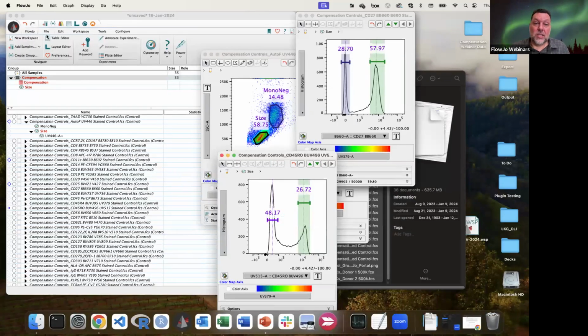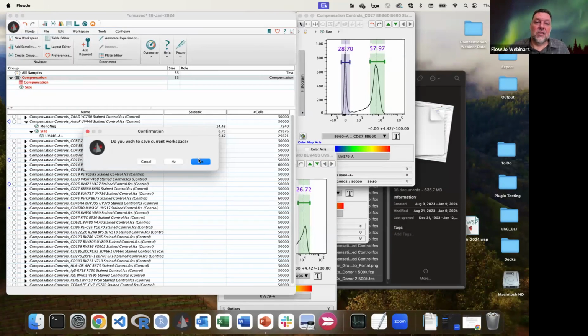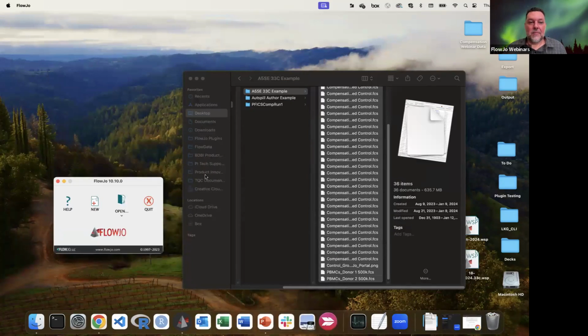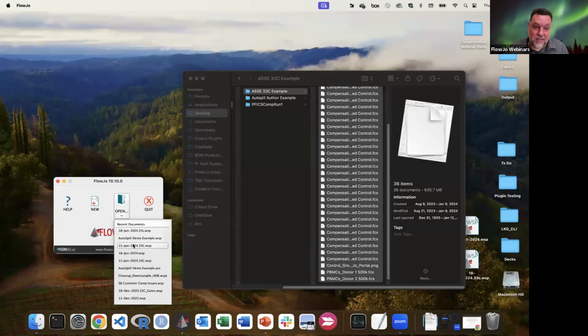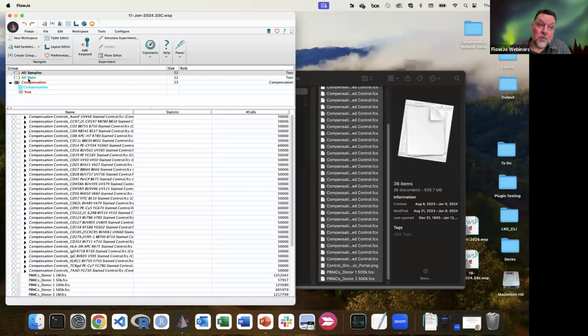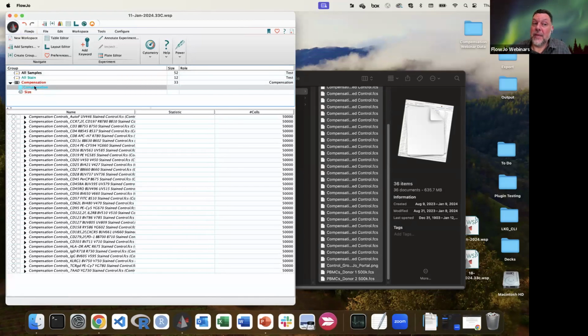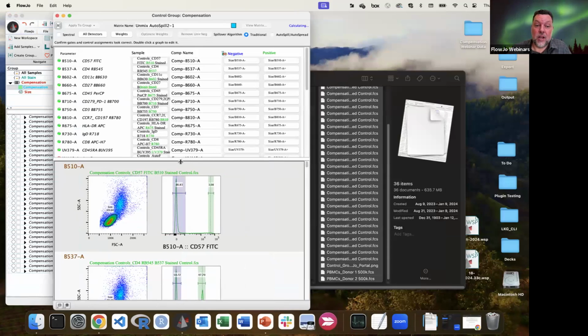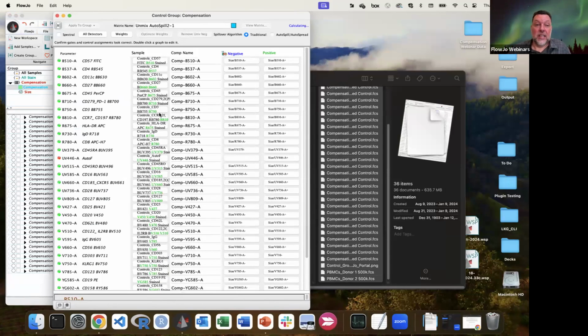Now I'm going to close this. I'll save it in case anybody asks a question and we want to come back to it, right? So let's go 33C and call it good on my desktop. But I do have a pre-canned 33 color one, right? So I've done the exact same thing here. I've created several compensation matrices. I can double click on the submenu from the compensation group here, and now you can see my setup. I'll try and spread it out as much as I can.